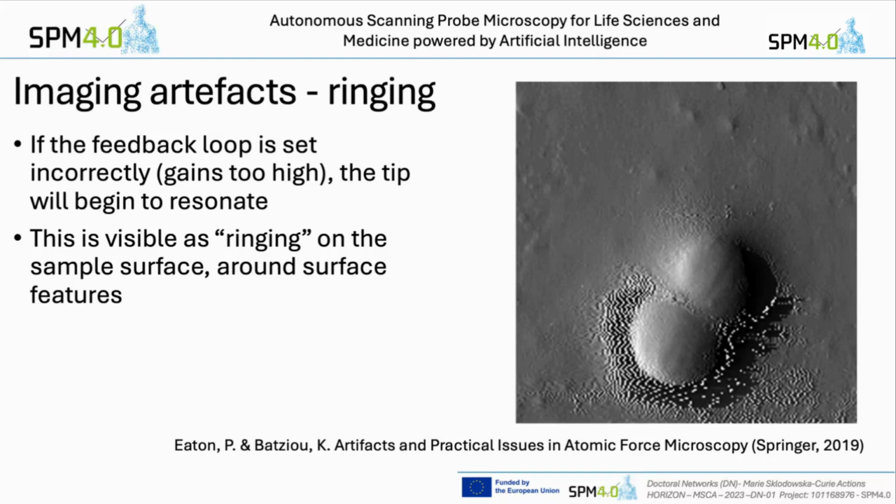And again, this is something that needs to be considered during imaging, but also we need to be aware of when we're processing our images, that this doesn't influence what we're seeing.